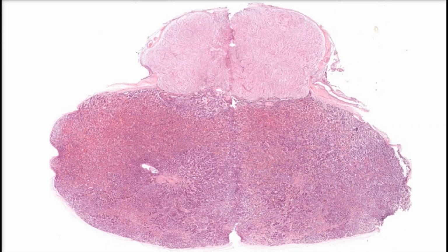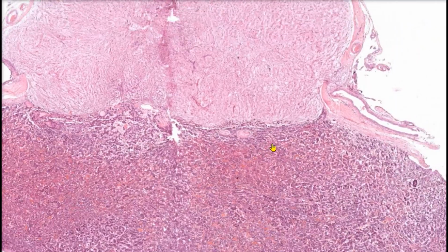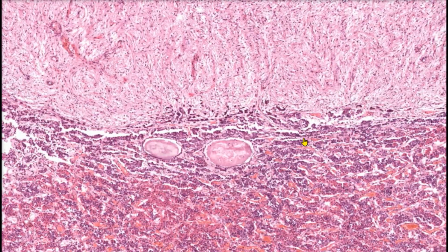The slide we're currently looking at shows the pituitary gland, also called the hypophysis. The pituitary gland is a collection of different cell types that control the activity of other endocrine organs. It sits within the sella turcica and is traditionally divided into 2 sections: an anterior pituitary up front and a posterior pituitary in back. We're going to zoom in on this section of the slide to get a better look at the cells. So let's zoom in here so we can get a nice view.